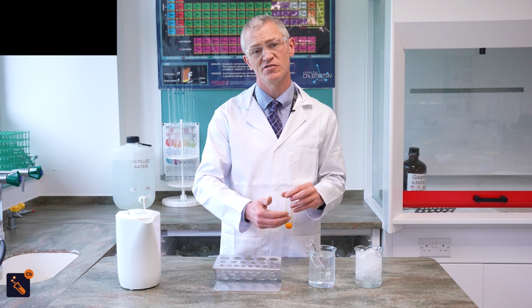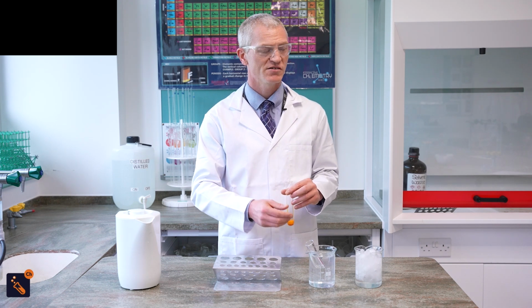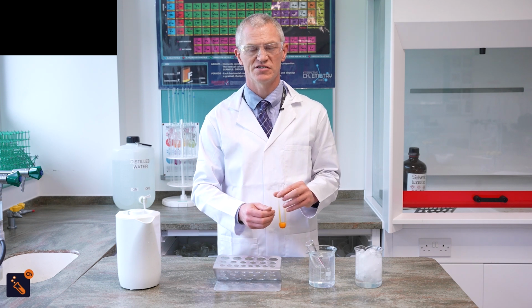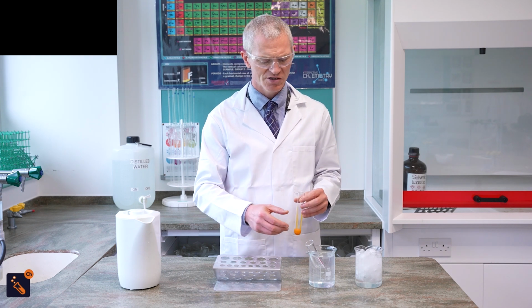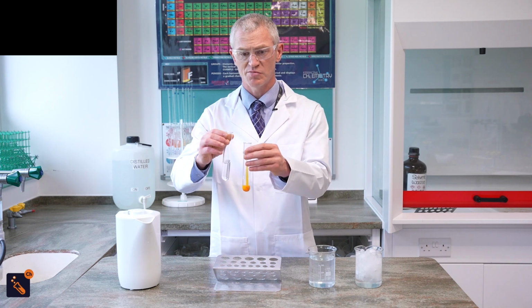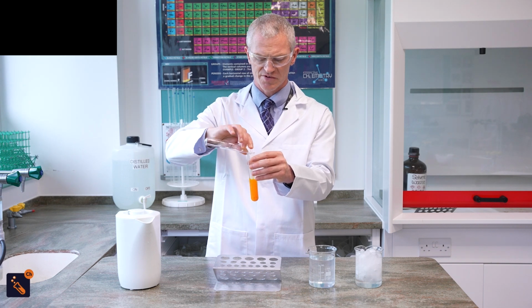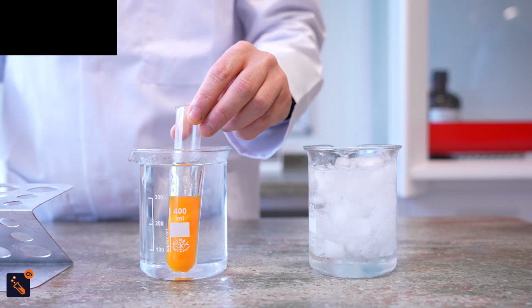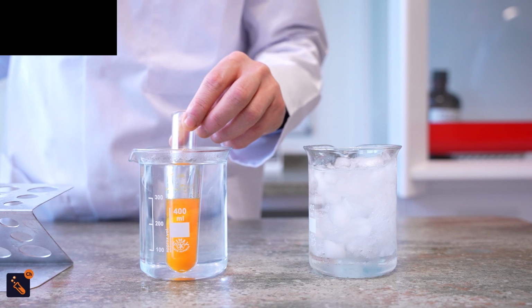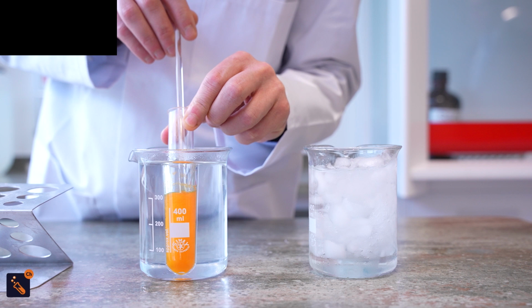But for this video, we've measured out the exact amount of solvent that we need, so we're just going to add all of this in here. What we're going to do is take the hot solvent and pour it into this derivative. Now we're going to put it into that freshly boiled hot water, and we're going to make sure we stir it. It's going to take a little bit just to warm up.